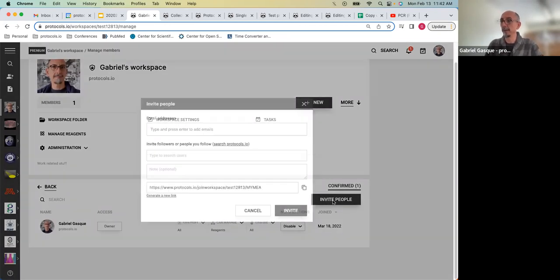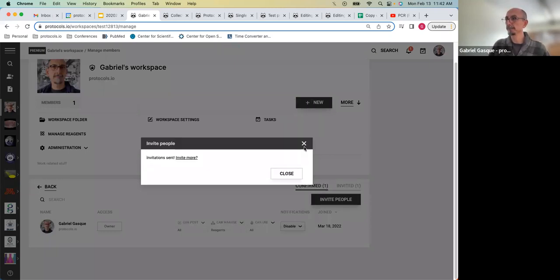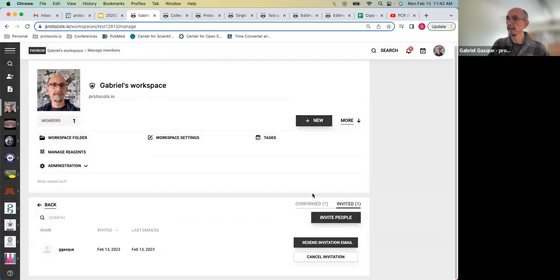You can invite people by using their email again. Or you can copy a link that will contain the invitation. So I'm waiting for him to accept the invitation, and he will receive an email notification.